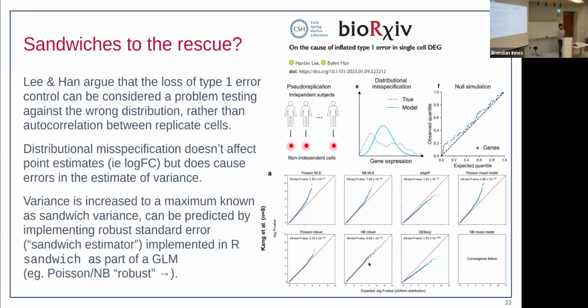Negative binomial, it's considerably better when it's robust. And then they compared it to pseudobulk methods, and they say the robust is even better than the pseudobulk methods, although that does depend on the number of samples you have. I highlighted the one with 8 replicates, which I thought was a little closer to our general realities.